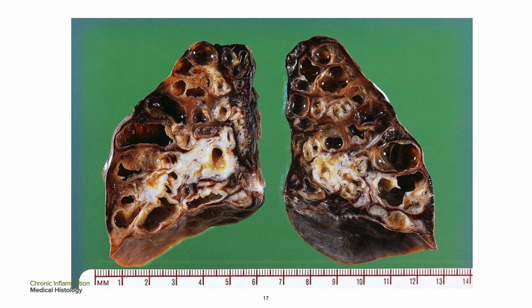Bronchiectasis. A left lower lobectomy was performed for chronic bronchiectasis. The patient had recurrent attacks of pneumonia since the age of one. The bronchial tubes are extremely dilated, their walls are thickened and fibrotic, and ribbing can be seen along the mucosal surface of some of them. The adjacent lung has been almost completely destroyed.